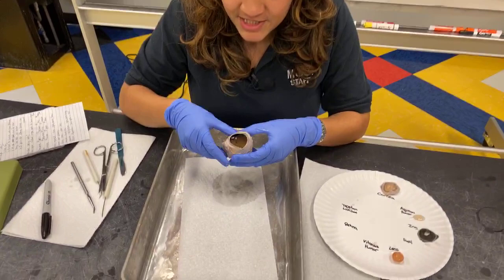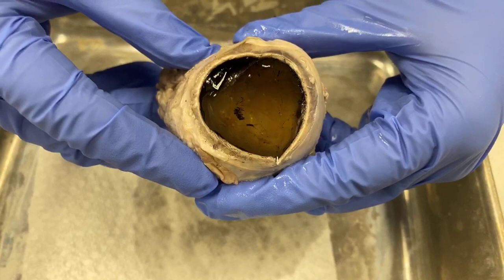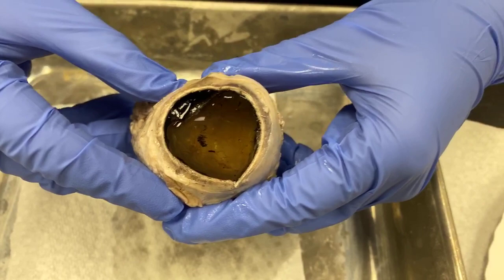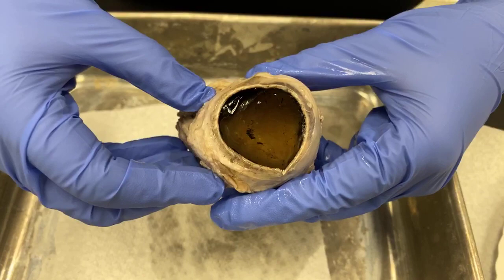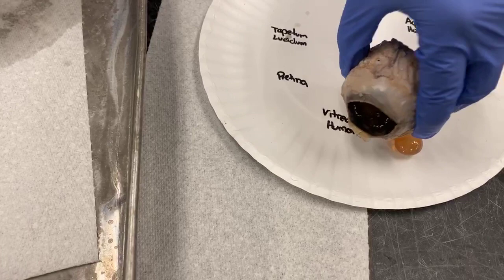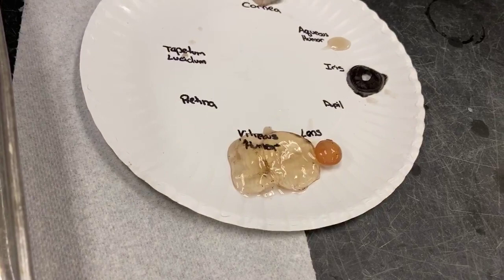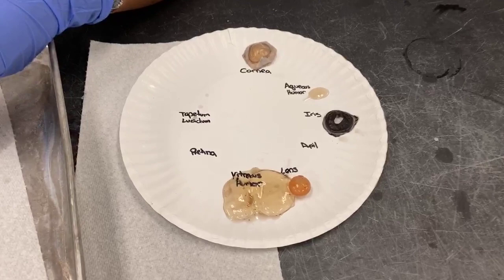The rest of the liquid in here is the vitreous humor, which performs the same job as the aqueous humor. There's more of it, and it's made more of protein, so it kind of looks like an egg white. It helps keep the eye in a spherical shape so that the cornea and the lens stay centered and can focus the light. That would be clear if we were looking at a live eye.